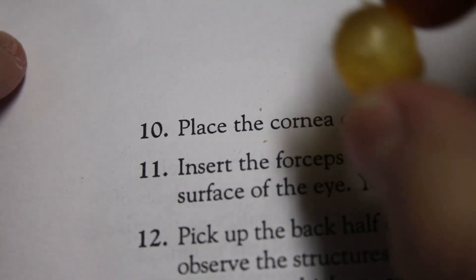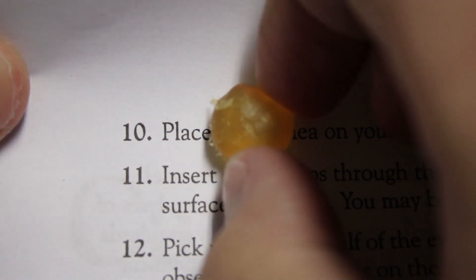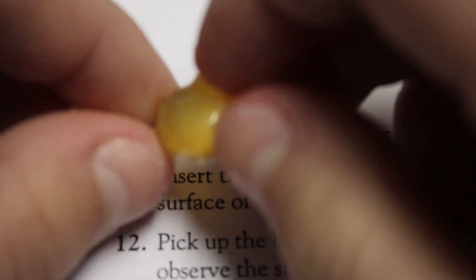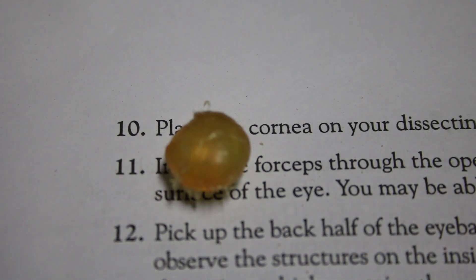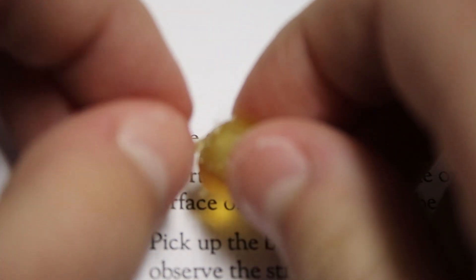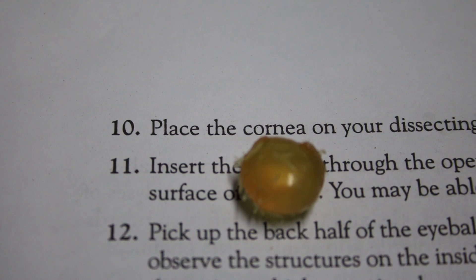Hey guys, Future Jacob here. I let the lens dry out for a little while and wanted to show you what it looks like magnifying. If you look really closely into the center of the lens, you can see the text scrolling by and it's magnified. My results were not great because I did not dry the lens effectively — you're supposed to dab it with a paper towel rather than wipe it, because when you first take the lens out it is soft. If you do it properly, you can get better results and magnify text more clearly. Back to the regular video.